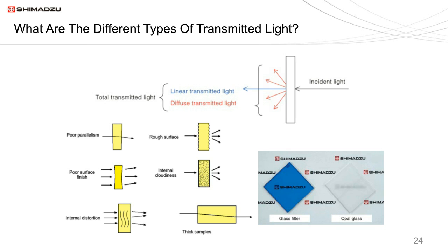All sorts of interesting things can happen when you put a solid sample into a spectrophotometer. If light passes through a transparent clear sample, you get linearly transmitted light, shown by the blue glass filter example. If scattering occurs, you get diffused transmitted light coming off at all angles — indicated by opal glass — presenting a real problem with measurement artifacts. You can also have issues if the sides aren't parallel, if you have a rough surface, internal cloudiness, internal distortions, or if your sample is long and reflects the light. This causes all sorts of artifacts when the beam strikes the detector.